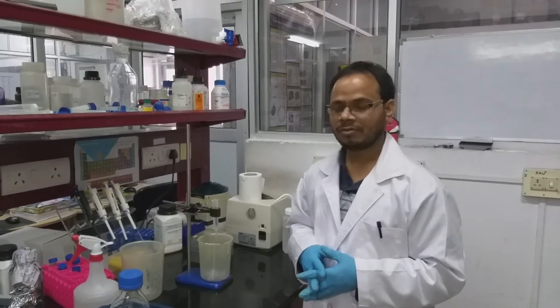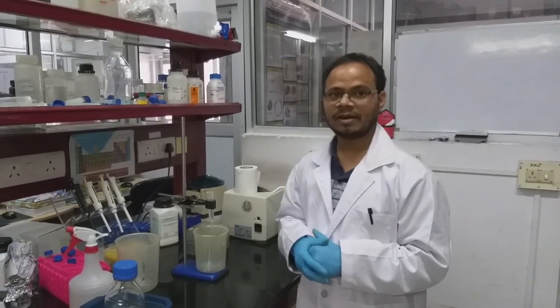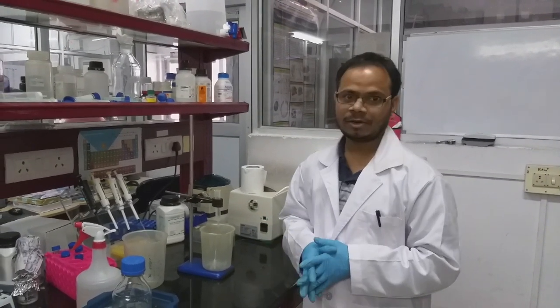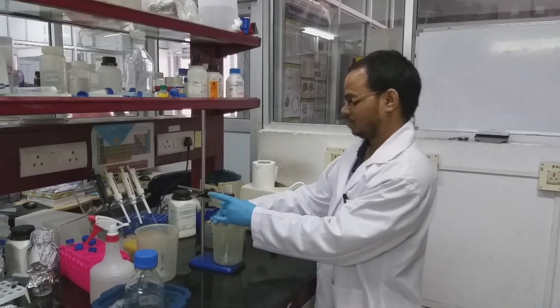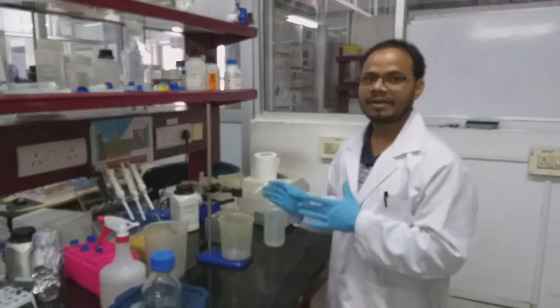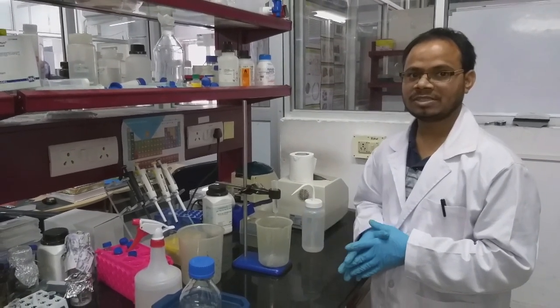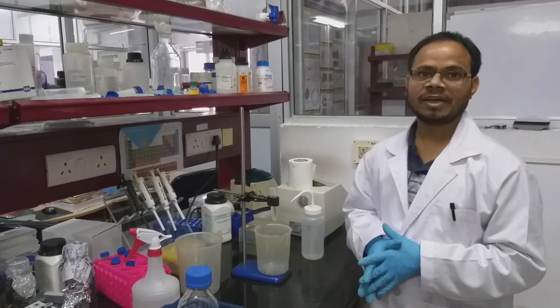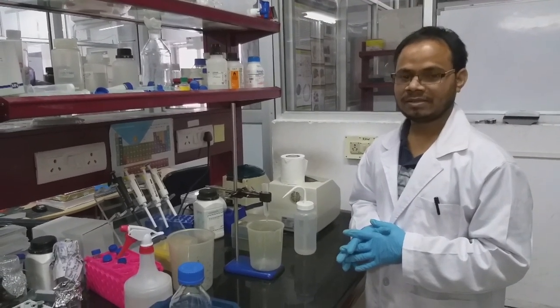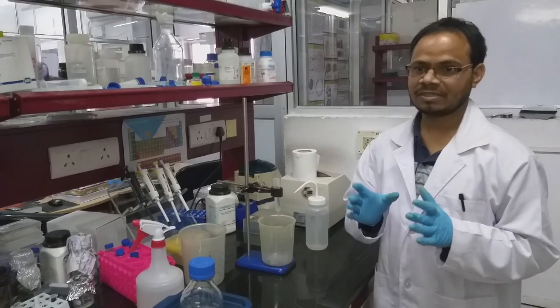While the centrifugation is going on, we have to wash the column. The column is in 20% ethanol, so we have to wash first with water, then equilibration buffer. Let the 20% ethanol drain completely, then we will add double distilled water. At least 5 column volumes of water should be added to remove it completely. And next we will equilibrate with the lysis buffer, the buffer which we used for the lysis of the bacterial cells.